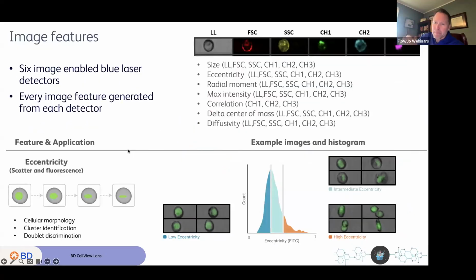Okay. And then I've kept in, every time I do one of these talks, the slides that are just what are the image parameters? Just because I feel like that is one of the primary questions that are worth knowing. I'm curious if that's over the slide for you all also. It might be the picture of me talking. I'll move that out of the way.